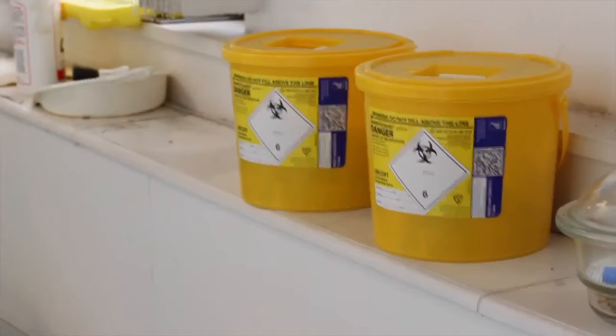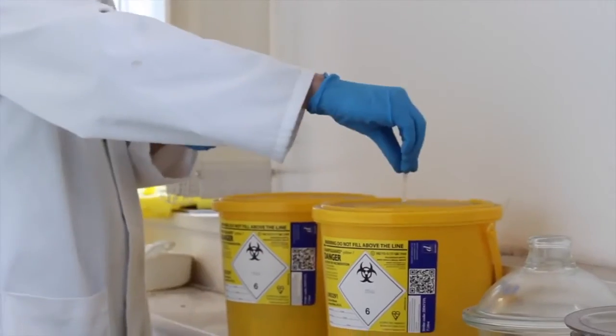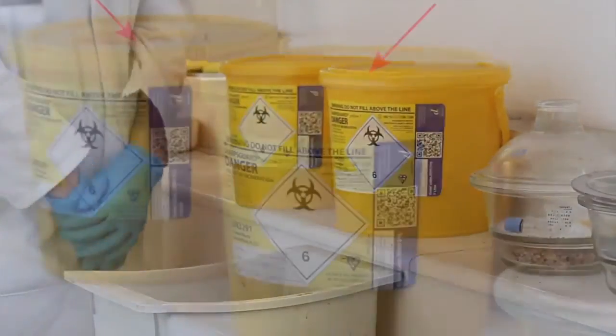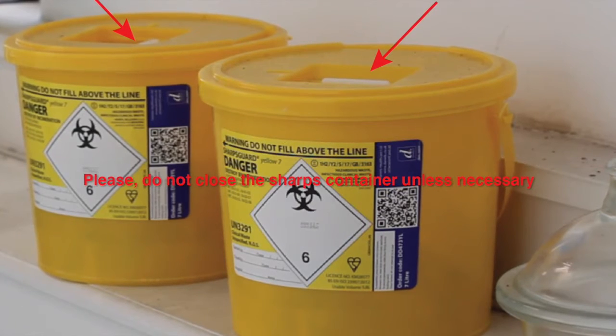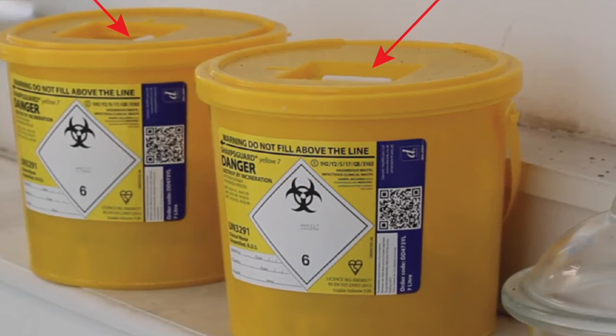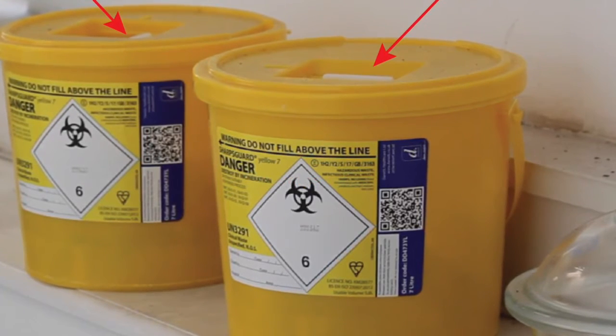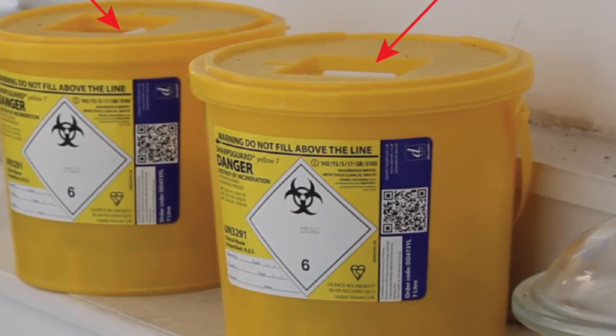The sharps bin is by the window close to the waste fume hood. In here you can throw any clean or contaminated sharp object that you need to dispose of. Needles must be detached from the syringe and the needle guard must be put back on before you dispose of them. Please do not close the container because it has a safety lock that does not allow it to be reopened. If you find one of the sharps bins to be full, then you can close the lid on top and take it to the solvent dispensing facility in the basement of the School of Chemistry.